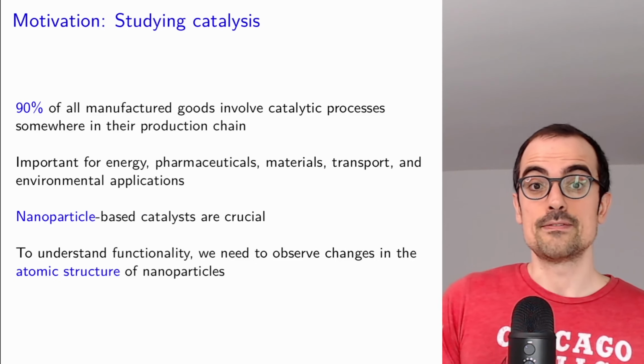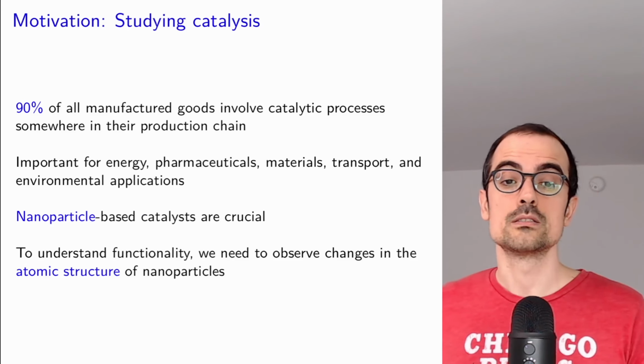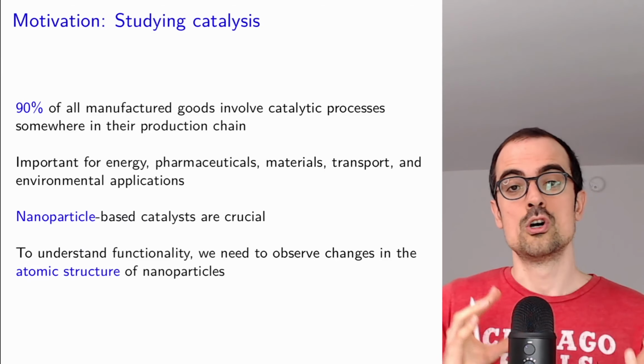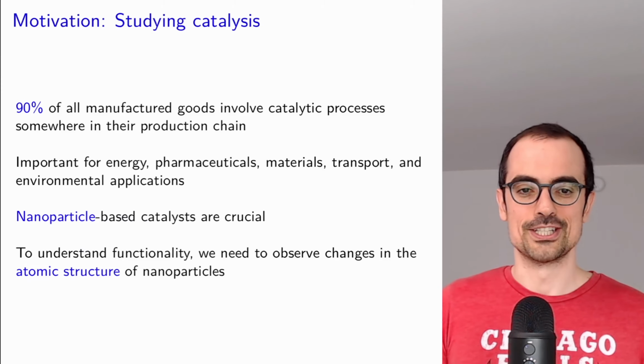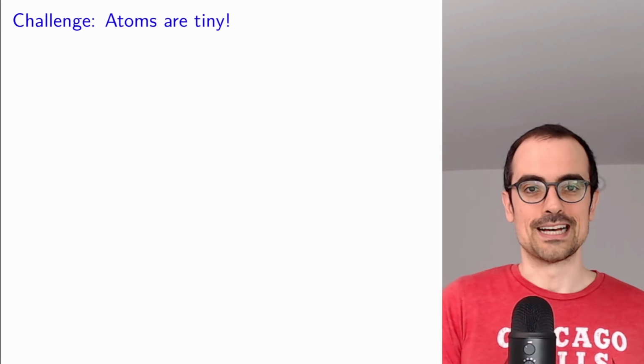In order to understand the functionality of catalysts that are based on nanoparticles, we need to observe the changes in the atomic structure of nanoparticles. But this is actually very challenging. It's very challenging because atoms are very tiny.